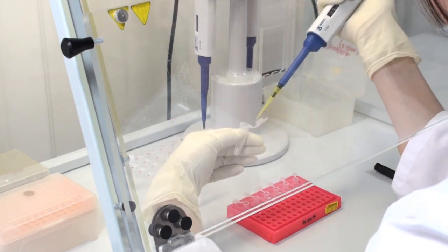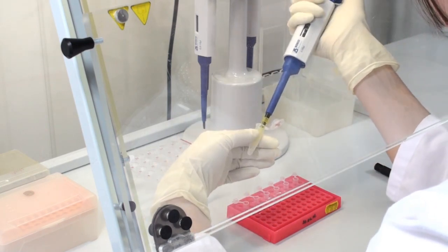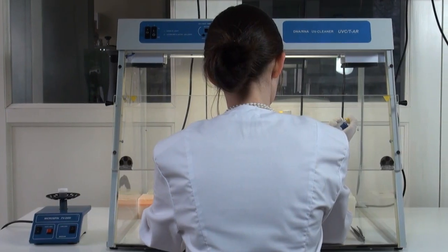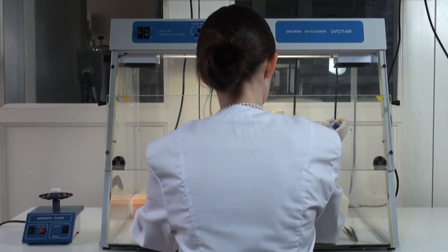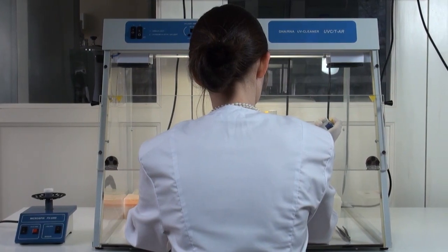All our models are benchtop type, made of metal framework, glass or plexiglass walls and working surface painted with powder enamel or made of stainless steel.